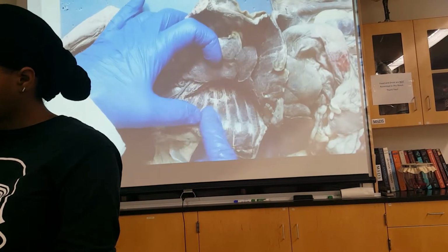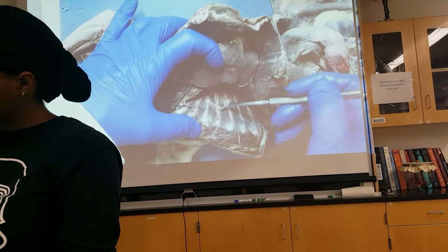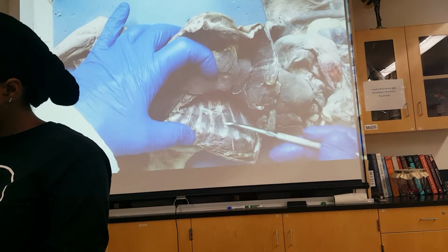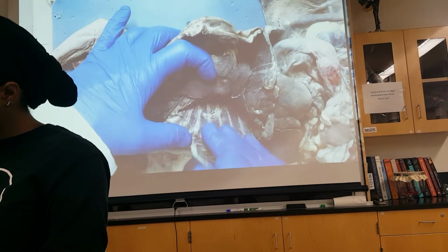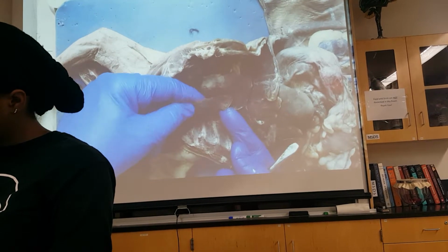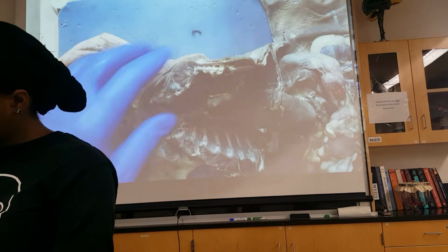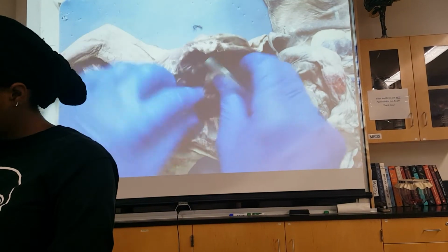One of the things to make note of here too is this shiny membrane that we tore away is one of those serous membranes in that cavity and membrane lecture that we did. This is the pleura, right? And this happens to be the parietal pleura that covers the rib cage. The visceral pleura is on the surface of the lung so that when these rub, there's no friction. So good thing to note while we're here. But we found posterior intercostal nerves, find them on both sides.